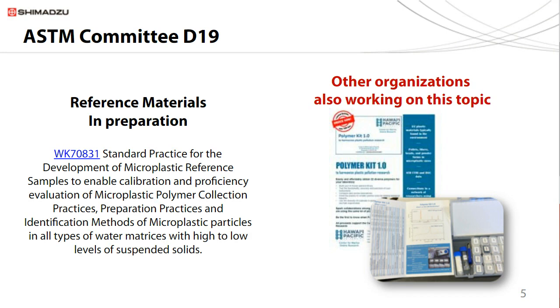In addition to the work that ASTM is doing, there are other organizations also working on these topics. ISO is doing a lot of work, and for example, Jennifer Lynch at the Hawaii Pacific University Center for Marine Debris Research has prepared a kit with information from several standards that have been analyzed by infrared and also differential scanning calorimetry.